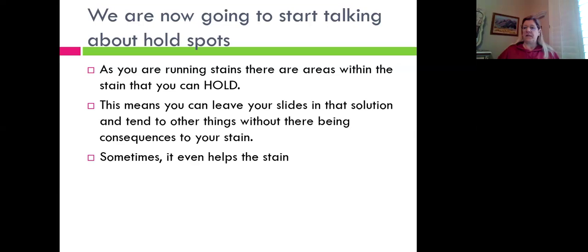You're going to be manipulating these special stains in the student laboratory, and as you're learning in the student laboratory, it's important that you know these holding spots to give you latitude to finish up or continue on with a different stain.